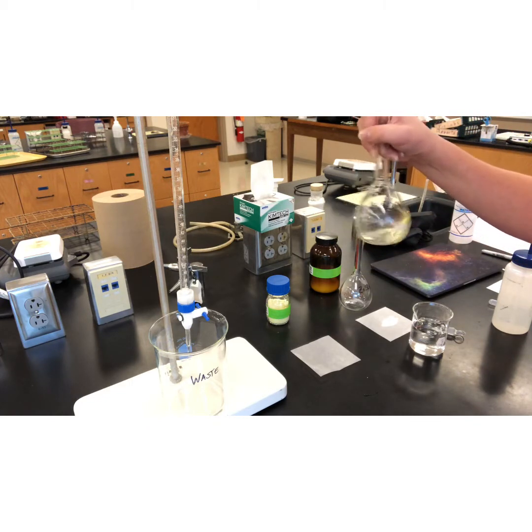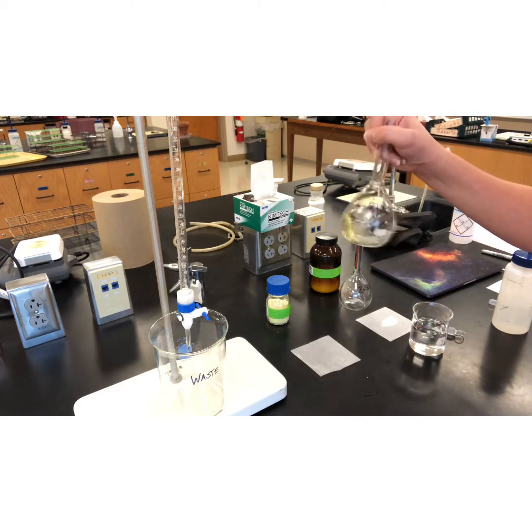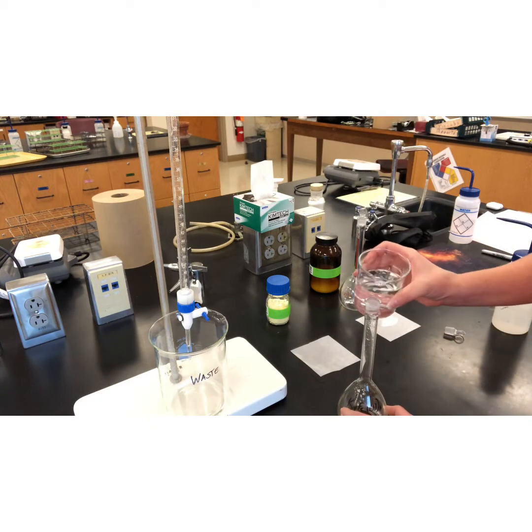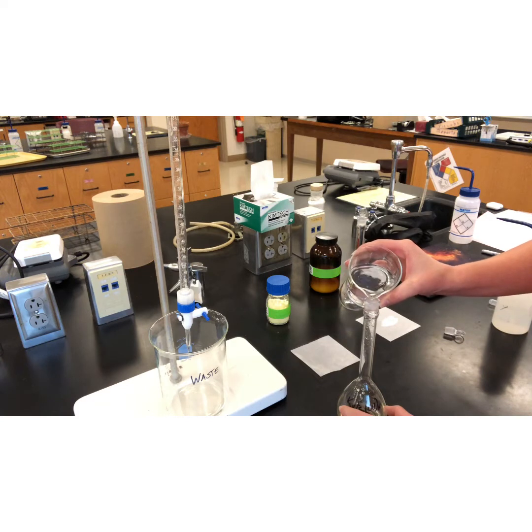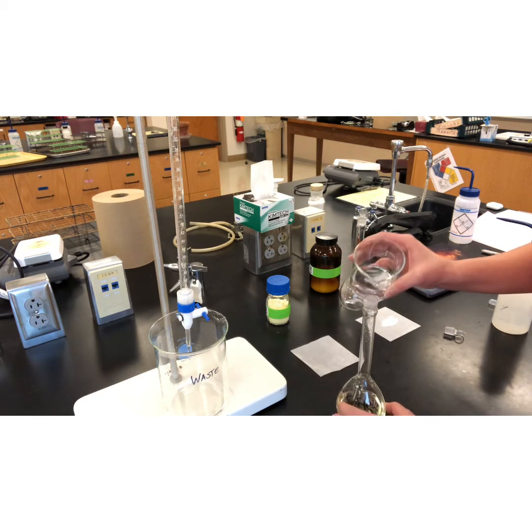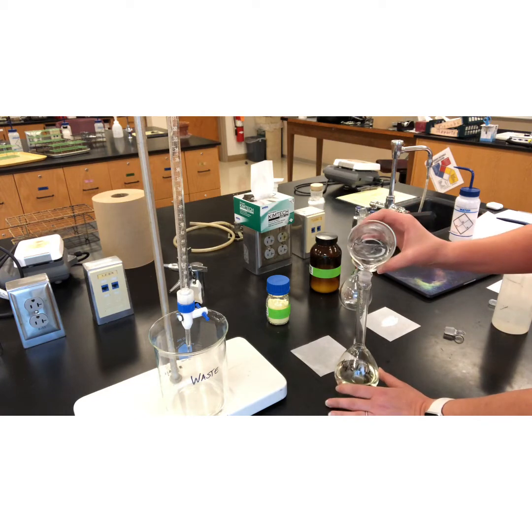All right, so my solute is starting to dissolve into my solution. Most of it's in there. I'm going to add a little bit more water, deionized water or distilled water. Swirl it again. Like I said, you always want to take it easy. You don't want to go past your marking on the volumetric glassware. You're going to end up unhappy and redoing it.